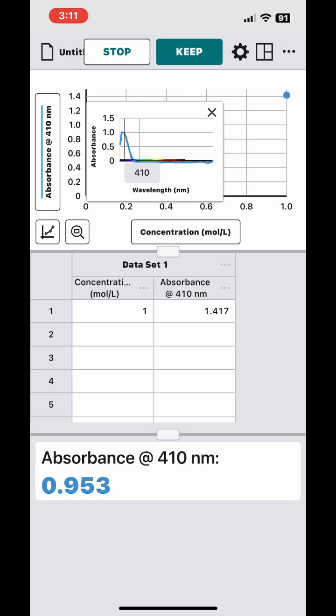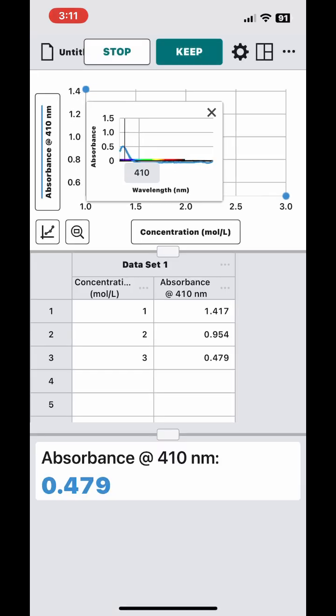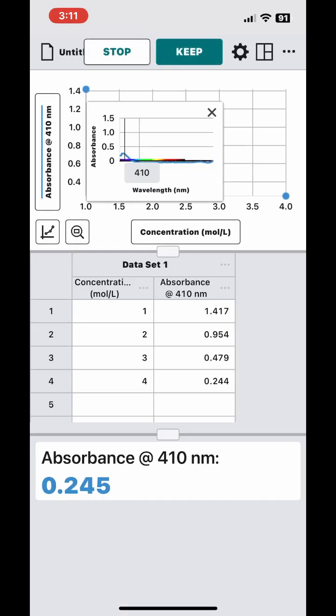So I know you can't see it right now, but what I'm doing is collecting data by simply putting the cuvette in the lamp, and then I press collect, and then it takes you to another screen, and then you press keep point, and that's how you actually save the data. And just know that once you save a data point, you can't really delete it unless you delete all of your other data points. So just something to keep in mind. And I'm doing this for all 5 standards of known concentrations, as well as for the experimental group.